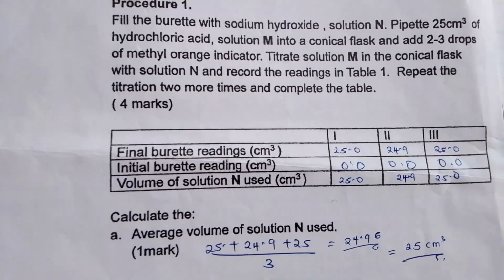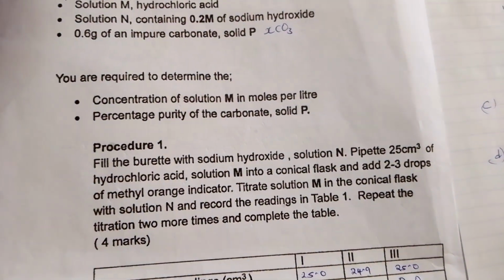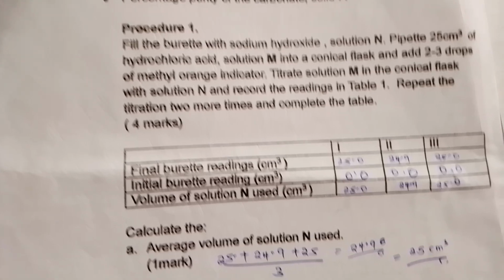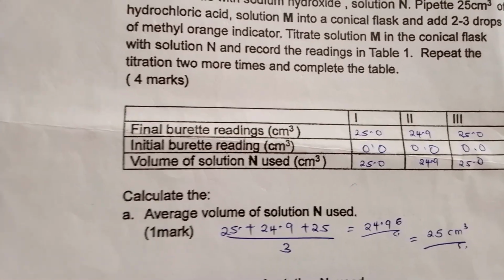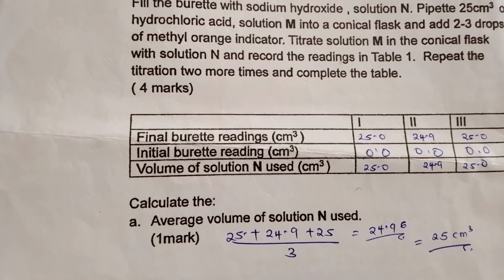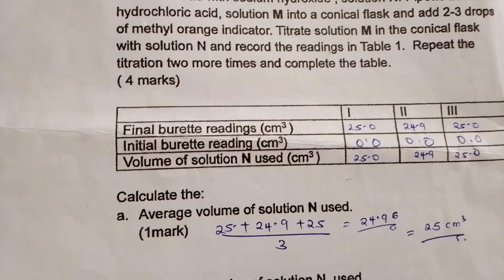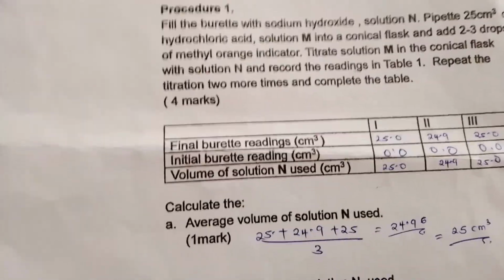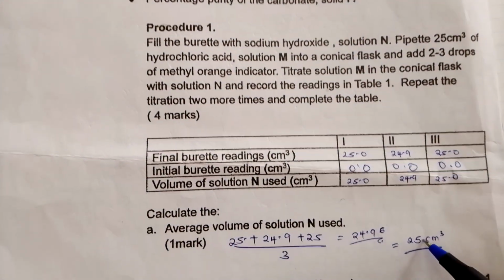Remember, solution N was sodium hydroxide. It was the one that was placed in the burette and then titrated against the acid, hydrochloric acid. So we found the average volume as 25.0.